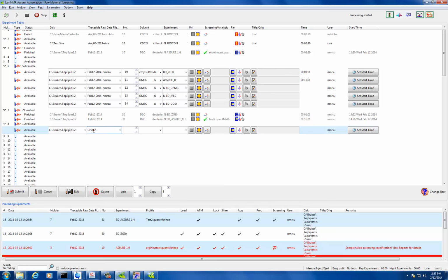Yeah, because this is going to be the folder. Try the database instead of the samples. What do you mean? He said that the general company has a database for the juice, and today we use the database instead of the standards. But we still need a general quantification standard for all quantifications to be referenced.